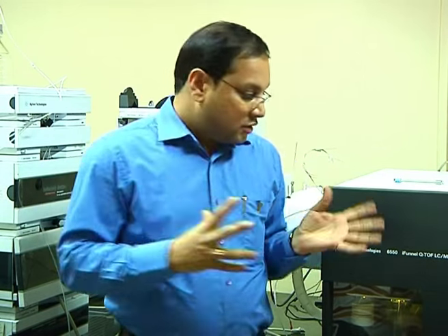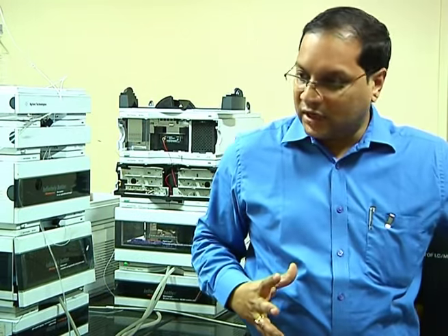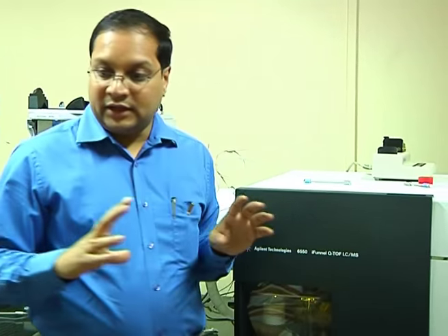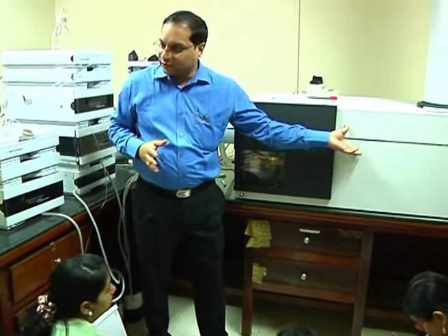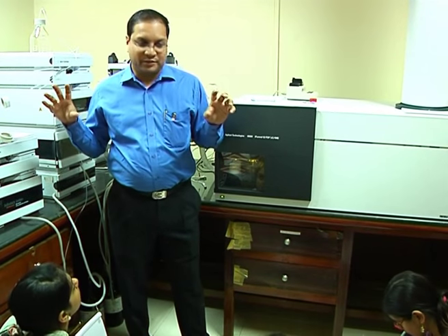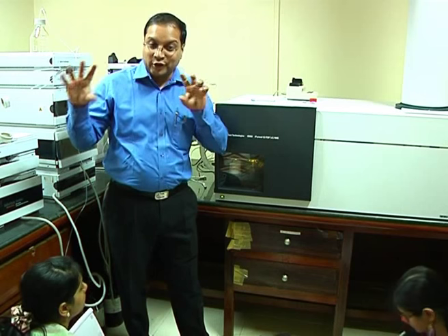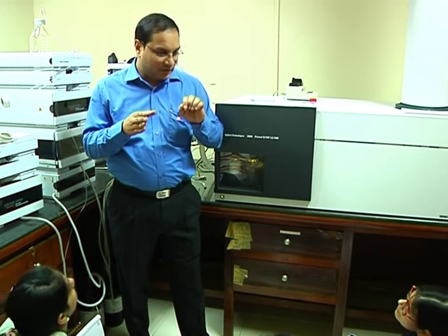You have heard the name triple quad. Quadrupole, collision cell, another quadrupole. Instead of time of flight, if you put another quadrupole, it becomes a triple quadrupole. And when you have 2 mass analyzers with the functionality of MS-MS in terms of a collision cell, you call them tandem MS, because they are talking to each other. They are in tandem with MS-MS in between.